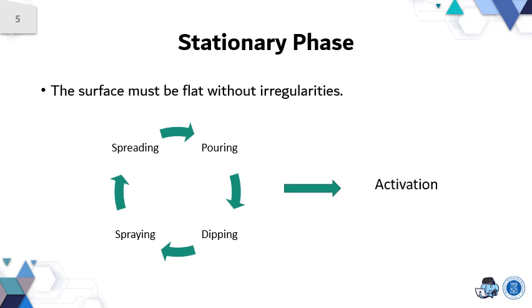The next step is dipping. This technique is used for small plates by dipping two plates at a time, back to back, in a slurry of adsorbent in chloroform or other volatile solvents. The exact thickness of the layer is not known, and the evenness of the layer may not be good.